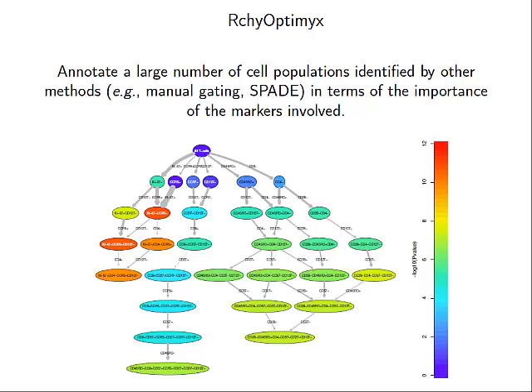But this is also for bang for the buck. If you're somewhere here on a four color, I can add one more color and it's really going to help me a lot. But that's also shown by the color itself. So this requires two distinct groups. Yes. Right, we're doing discovery.